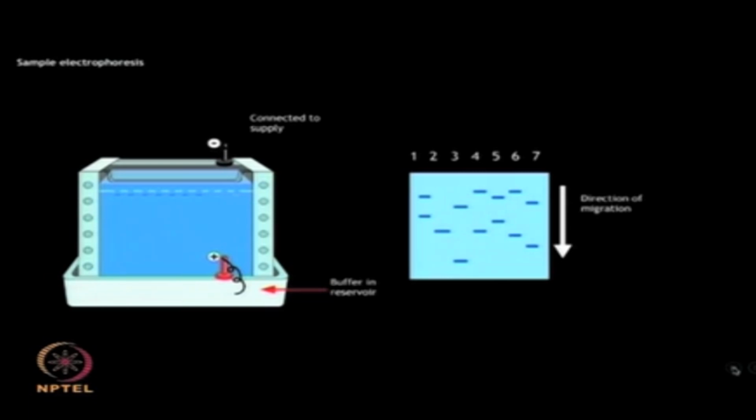The larger proteins are retarded in the gel and remain close to the point of application, while the smaller proteins migrate further along the gel. The gel can then be stained with Coomassie brilliant blue and viewed to observe various discrete protein bands.